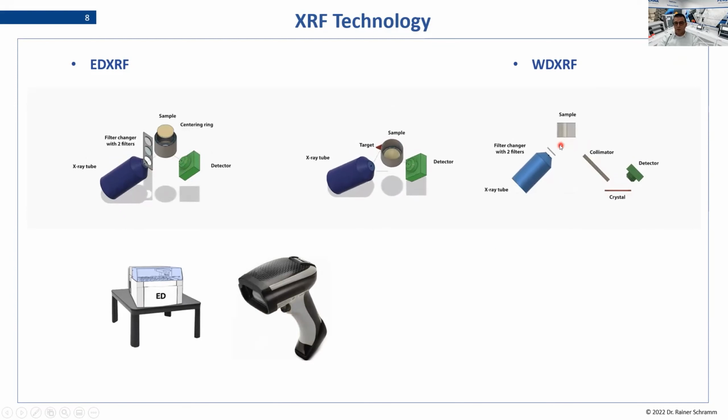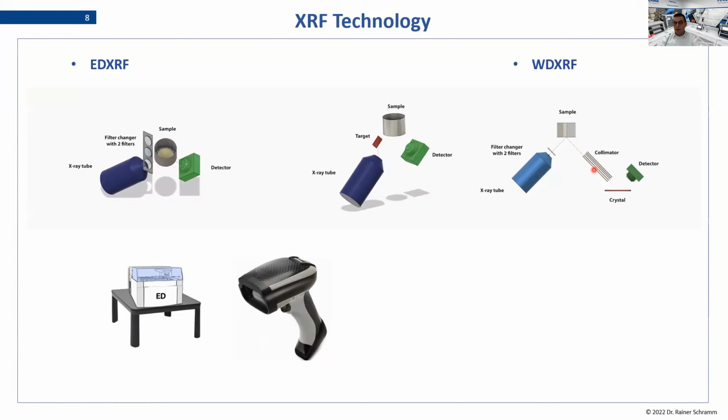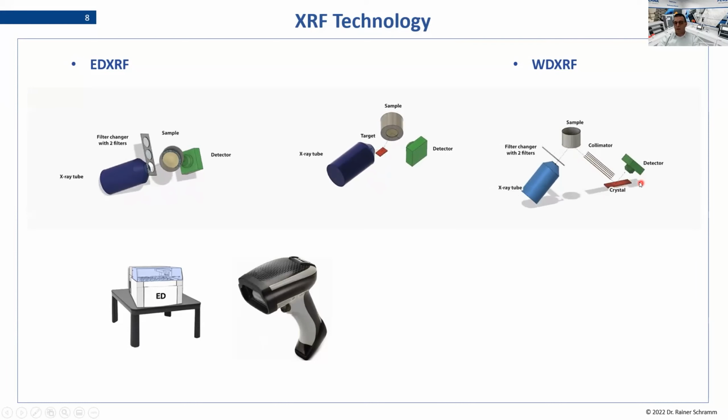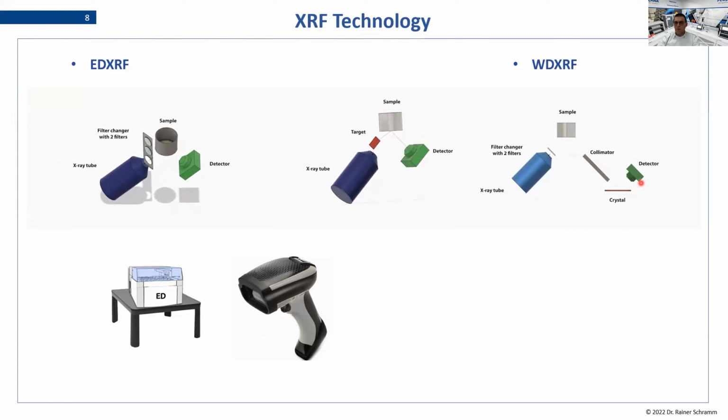And this allows us, of course, to get a higher sensitivity and a better resolution. Resolution, you remember, was good on the heavy element side, but not so good for light elements with low atomic numbers. So that's where this wavelength dispersive technique has its performance.